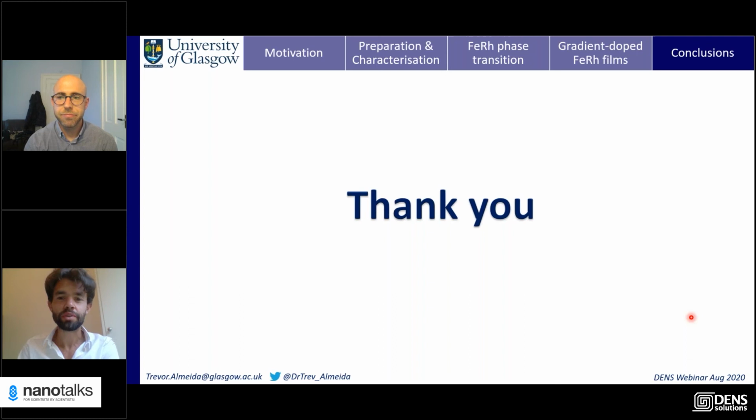So the first question was from Bin Bin Wang, and she says, or he, "Hi Trevor, very nice work. I was wondering which package you are using to do the after process analysis, and what's the critical thin film thickness for such work in cross section?"